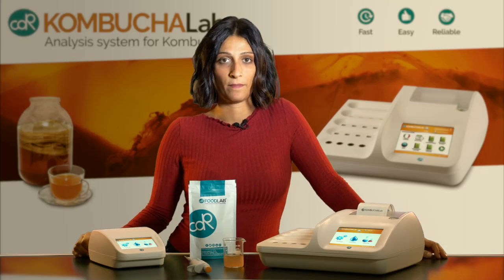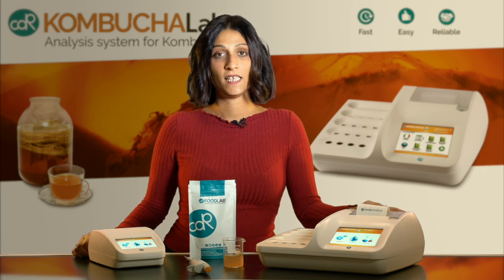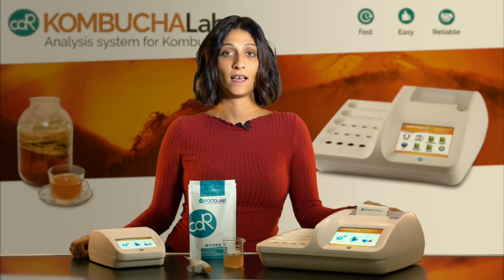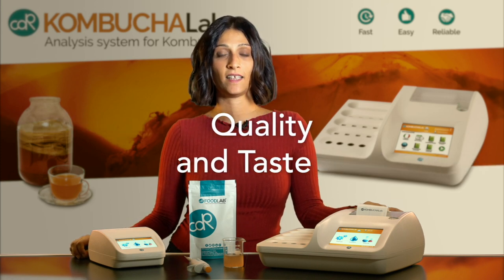This is CDR Kombucha Lab, the innovative, easy and reliable way to test your Kombucha from start to finish, to ensure quality and taste.